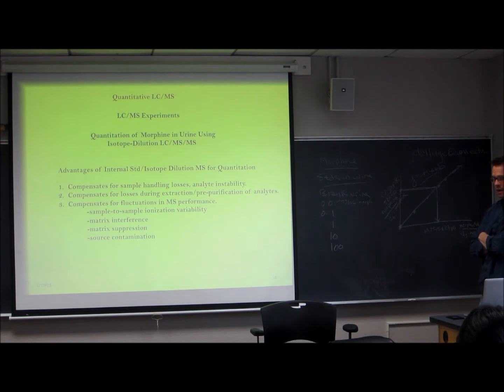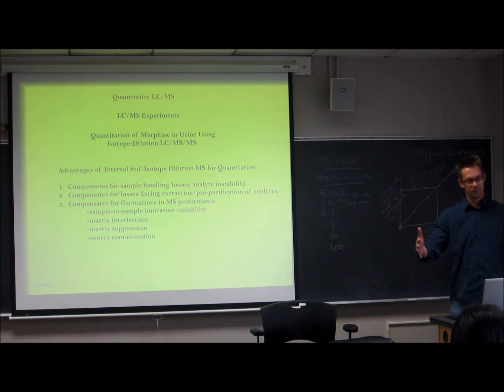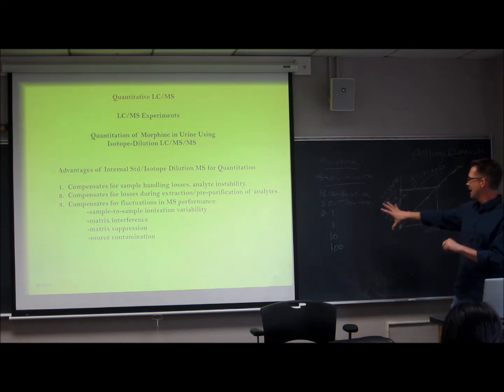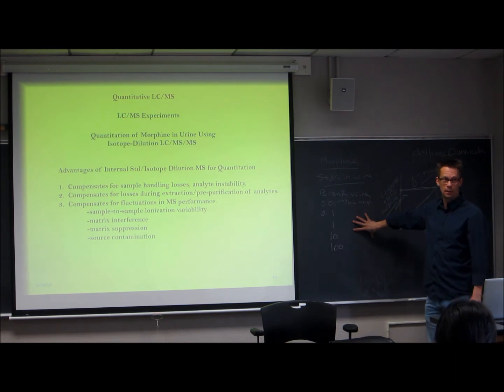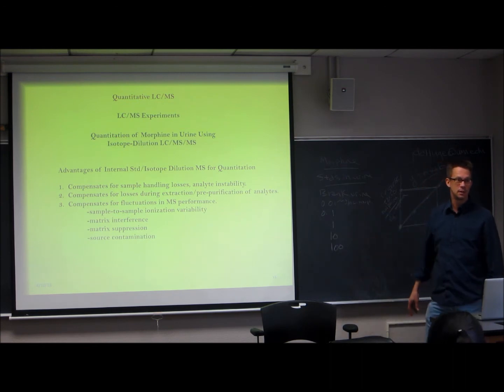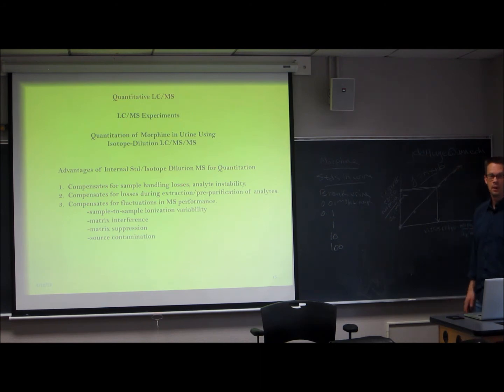So the simplest way to do isotope dilution LC-MS/MS is you make up your set of standards. The other thing that I didn't mention about isotope dilution is you no longer have an absolute requirement, although it helps and is superior if you can do it, to make up your standards in the same matrix that you're analyzing in.